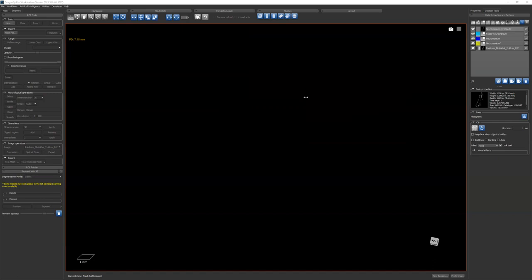Okay. So what I wanted to show you is what it should look like, and also what happens when you have an oblique specimen. Ideally, these would be square, but really we have this oblique cut because that's how it actually is. So we're seeing the real reconstruction.